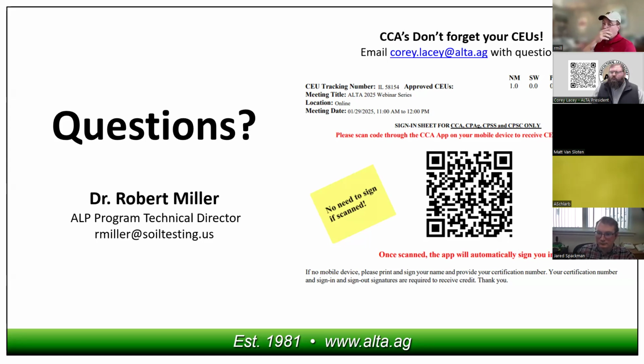In the first line project we're planning to do CEC measurements at two pHs, 7 and 5. My data set is pretty limited, but it suggests that a soil with a CEC of 8 at pH 7 could be 4 at pH 5.0, a 50% reduction.